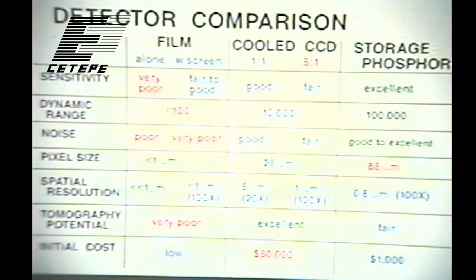In terms of a two-dimensional detector for micro CT, these cooled, non-intensified CCD-based detectors are the best available today. I think it'll be about 5 years before these amorphous silicon panels achieve the same low noise levels that CCDs currently have. And then they'll be better because they can be made into large formats. So you can magnify small biological objects many, many fold onto them, okay? And detect X-rays directly instead of first converting them to light and then imaging it onto a CCD.